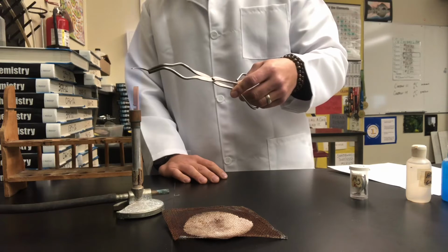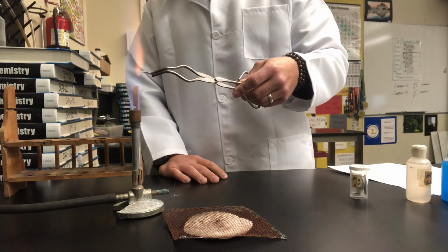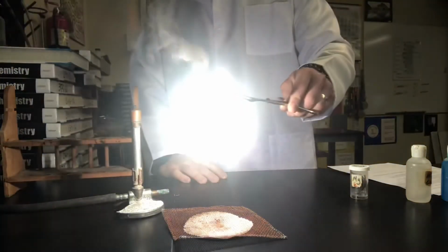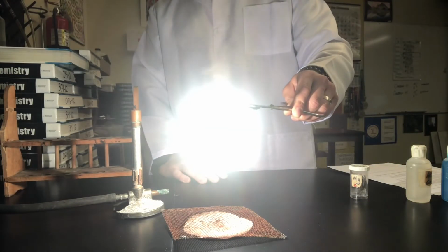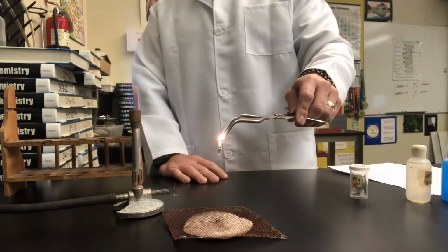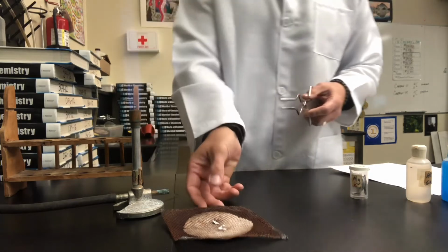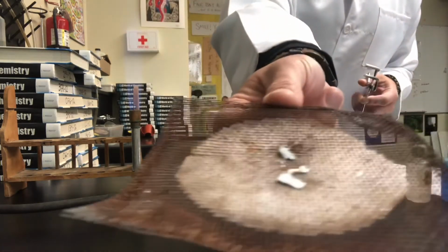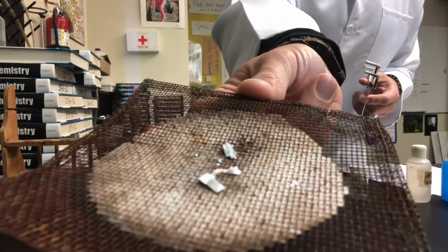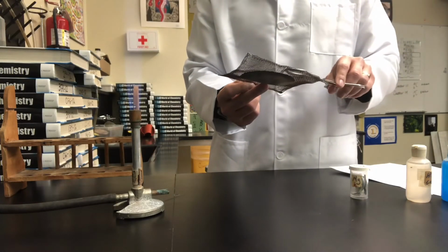So here goes. Let's see if we can get it heated up first. And you'll see a reaction, and there is the reaction. The magnesium is reacting with the oxygen and burns. And then at the end, after it burns, it gives off a great amount of light. It has a white ash left over.